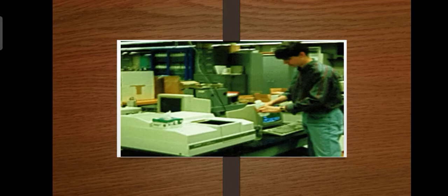Usage of UV-Vis in the laboratory. The energy needed to move an electron from one orbital to another is equal to energies of light in the visible and ultraviolet portions of the electromagnetic spectrum.